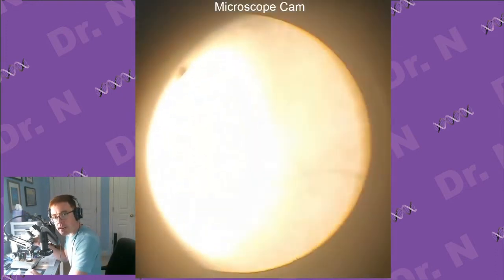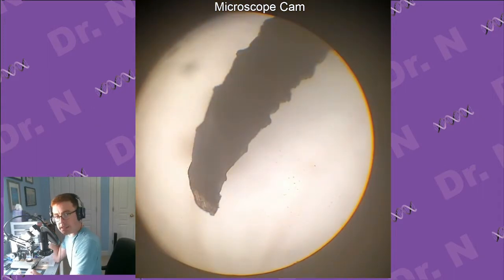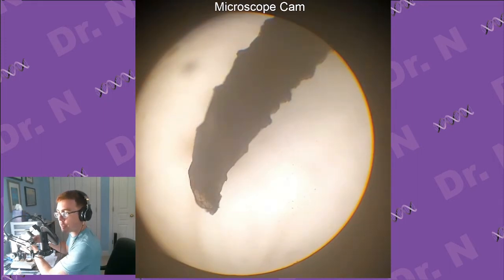Right now I'm at 4x plus 16x with the eyepieces. I kind of wish that I had something else like a 10x on the eyepiece for this, but I'll just grab out my forceps and give it a shot and see what we can do here. This is also going to be annoying because if I rest my hands on this microscope, it's going to change the level, which is going to completely change the magnification. And you know what? I'm going to have to try and take off some of these other objectives on this microscope so that my hands can actually fit. So I'm just going to remove the ones to the side really quick.